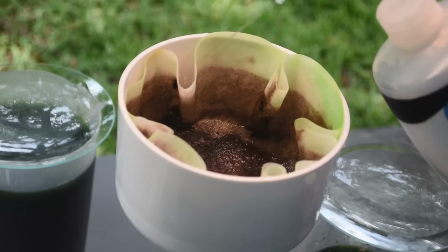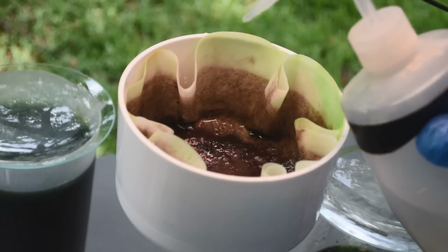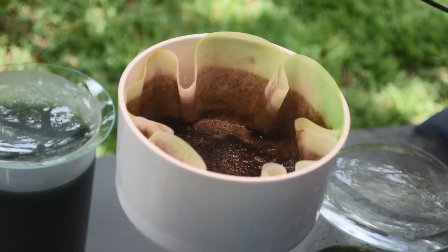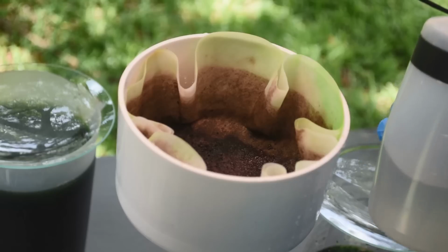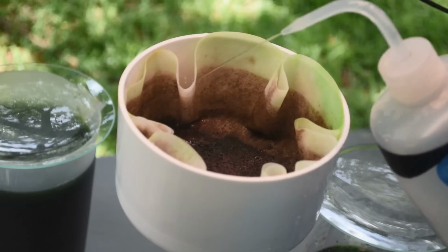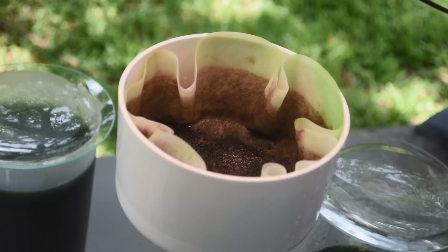Alright, so I'm going to rinse this a few more times. Then I'm going to pull this filter out to the side and put a clean one in because I've got a lot more stuff to filter. This is just going great. It's going like gangbusters. We got a lot of red stuff in here. For sure. A lot of red stuff. And I got a lot more I need to filter.